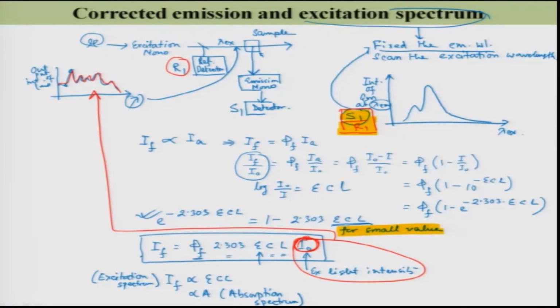Also, the concentration should be small, low. How low? The OD or absorbance should be in the order of 0.02, something like that, then it is applicable.